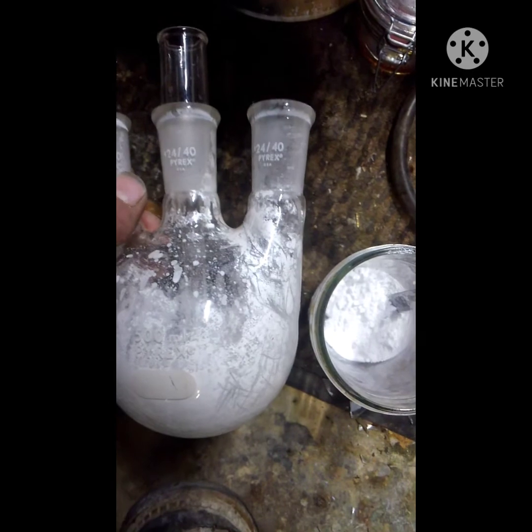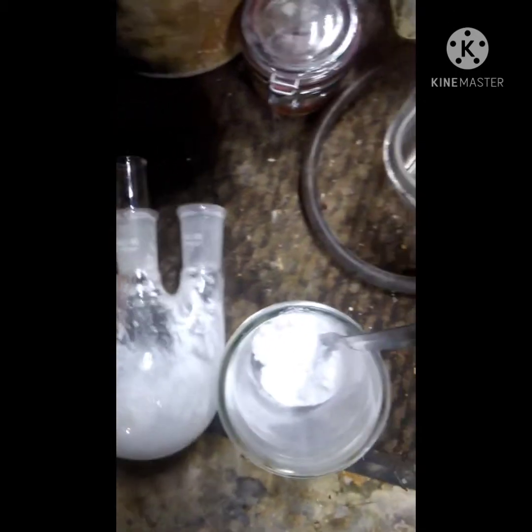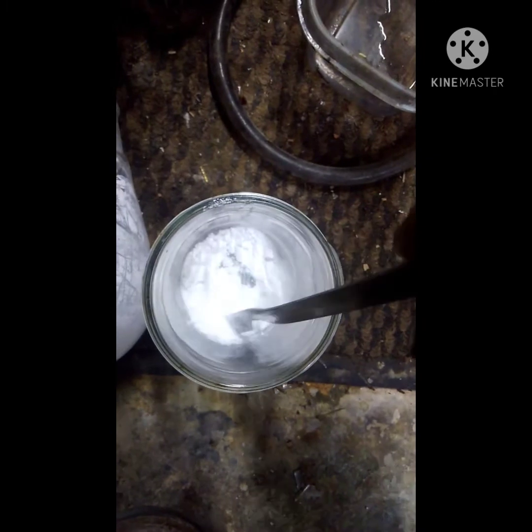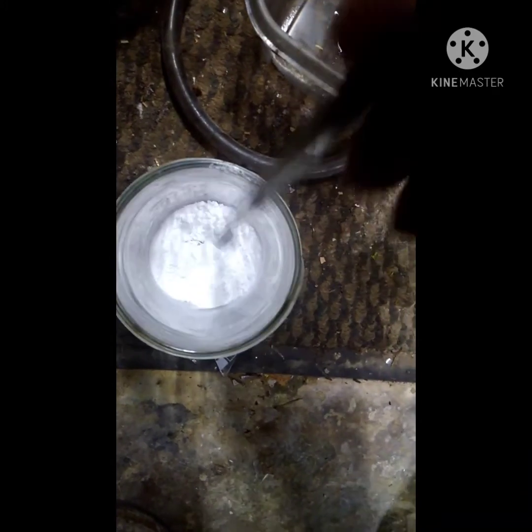After being in vacuum for about an hour I decided to check on it, and as you can see it came out pretty good. It turned into a nice powder — super dry. The aroma kind of smells like vinegar and plastic almost, definitely a smell of its own.